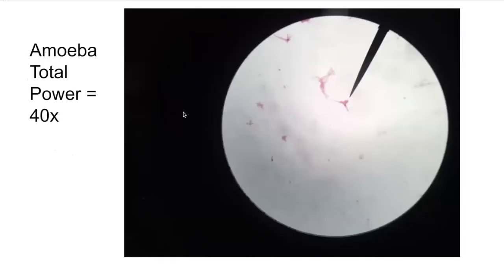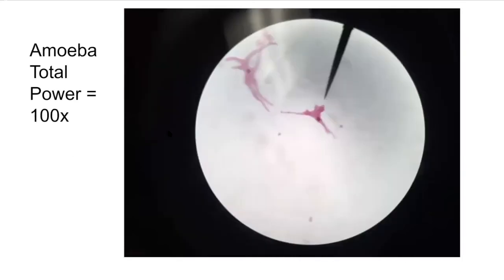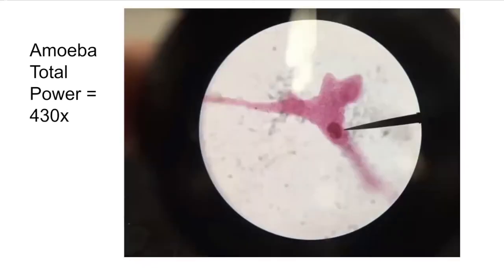Now let's look at the protists we were able to see. We started with our amoeba on low power — they have unique and crazy shapes. As we increase magnification, you can see more detail. At 430 times magnification, you're able to see the nucleus really well and these extensions of the cytoplasm called pseudopods — that's how an amoeba moves. It stretches out a pseudopod and latches onto a surface, then the other side lets go and pushes its cytoplasm toward the pseudopod. Pseudopods are also able to engulf food for the protist.